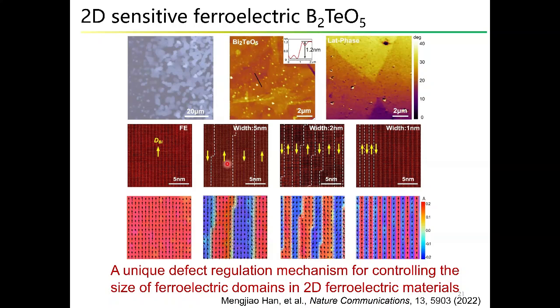Okay, so this is why we are very proud of the GIS system, that we are continuously producing a lot of good experimental findings that cannot be observed anywhere else, because we have a very unique experiment and very unique equipment to maintain the whole experiment without exposing to any air. So the whole experiment is quite clean.